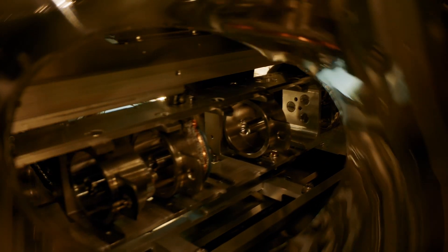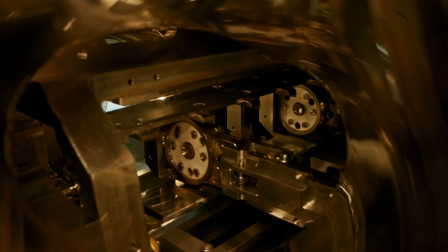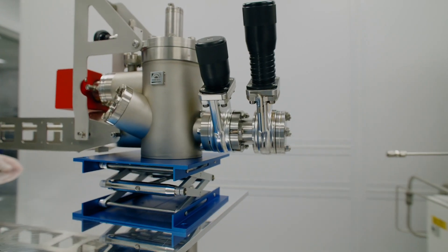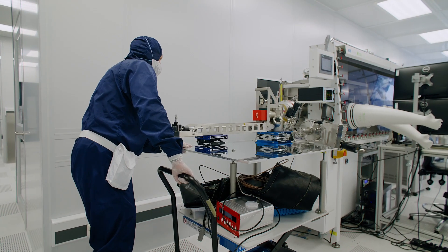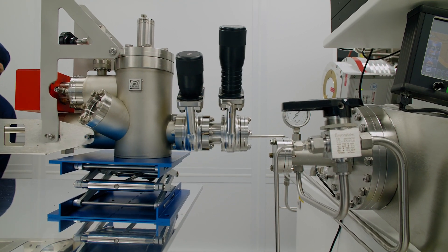With recent upgrades to the system, we're also able to process up to 18 samples simultaneously. We also have a number of vacuum suitcases that allow us to move samples between different parts of the Royce UHV suite, and we can take samples to different institutions or experimental facilities without breaking the ultra-high vacuum conditions.